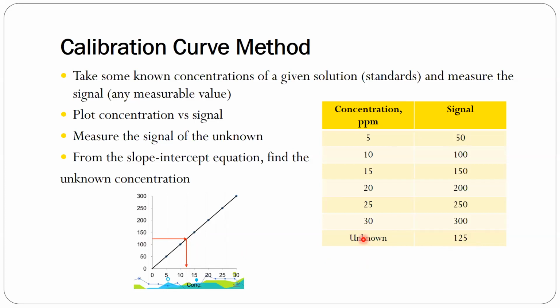Okay? Of course, we don't usually do this graphically with a piece of paper or graphing paper. We do this in Excel, and you don't really have to read off the concentration ng unknown. Kasi what you can do is, if you plot the Excel graph, you can establish the relationship by determining the equation of the line, di ba? Madalas natin yung ginagawa, yung y equals mx plus b. So alamin mo yung slope, alamin mo yung y-intercept.